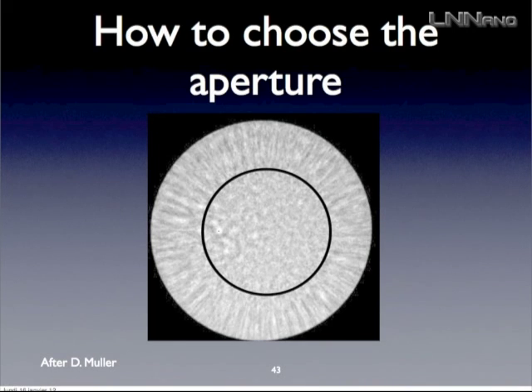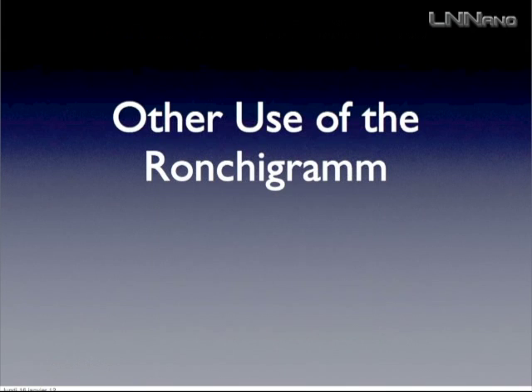And then it's done. You have the best probe for the specification of your TEM. So it's very important that you look at the Ronchigram and try to locate where there is this sweet spot. This is how you will have the best probe.